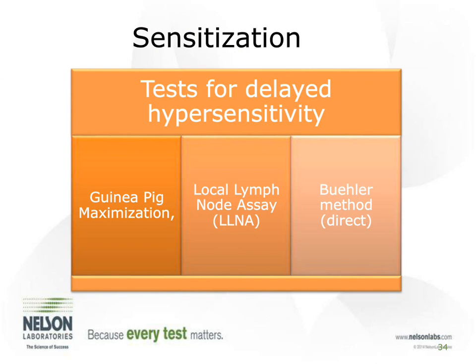Right now, the cost is close to being equivalent to the animal test based on the cost of the tissues, but it's a relatively new test, and the tissues are not supplied in the demand that we were thinking would need to be done. And so the cost and turnaround time would both go down once we get this more regulated and more occurs more often. Excuse me, going back. So the next test we're going to talk about is the sensitization.